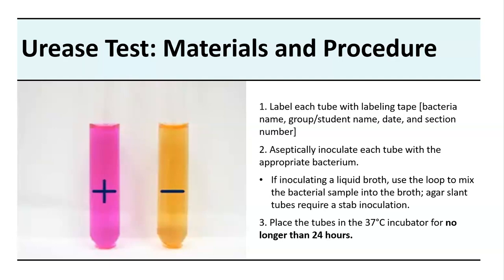We typically need to read this test within 24 hours if we're looking for rapid urease production, which leads to urea breakdown. But within that 24 hours, if the test turns pink, that's a positive reaction. If this test stays orange, that's a negative reaction.